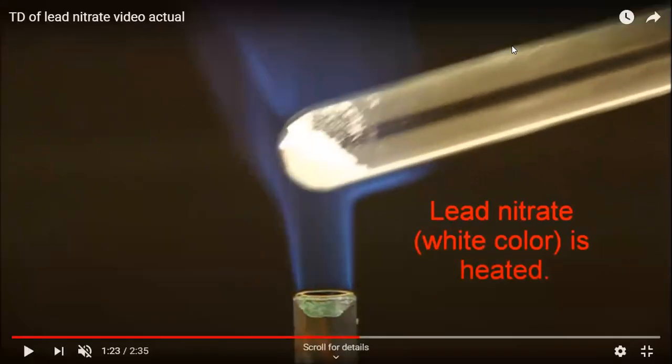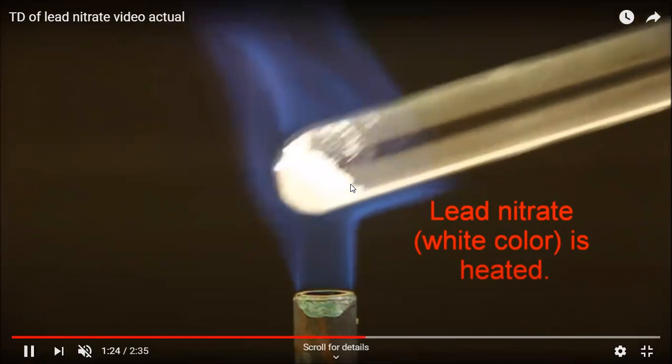The white lead nitrate is changing to which color? Yellow. Since this is a white powder, we say the formula is Pb(NO3)2. But in case you are initially using a colored powder, suppose copper sulfate, it will have a color initially. Why? I told you in the last video also. Because there is a presence of water molecules. That is why we write the formula as CuSO4.5H2O. But if there are no water molecules present in a compound, you can say the color of the compound will be white.